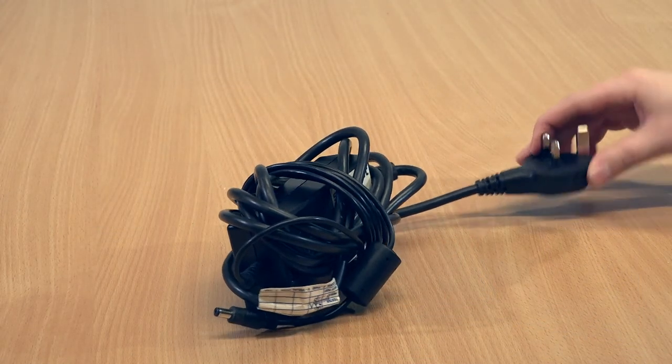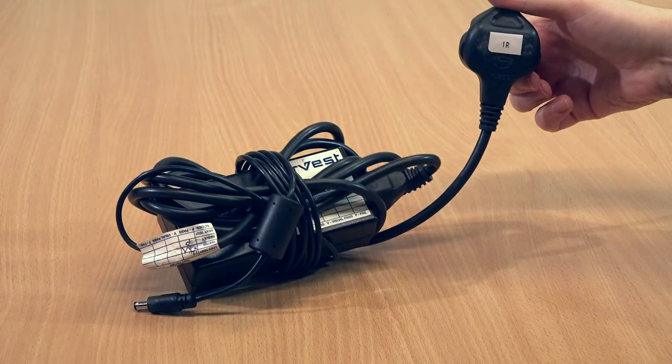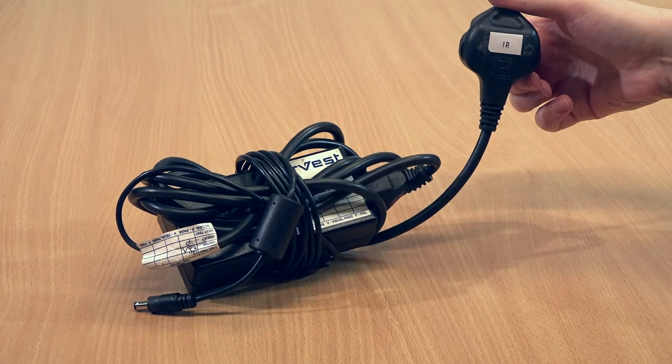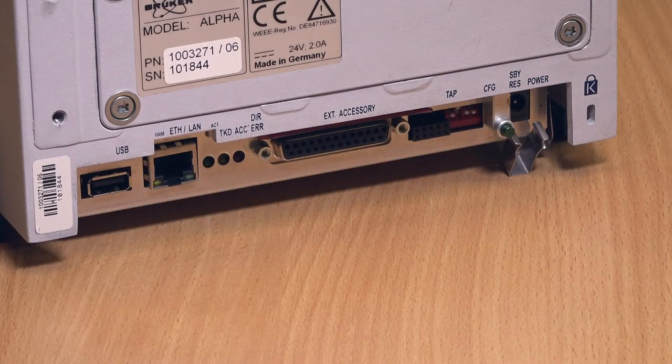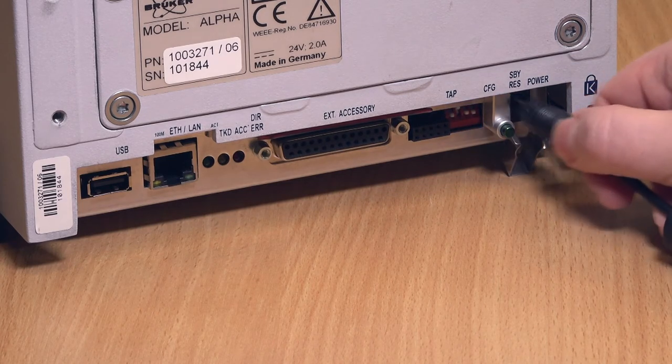The power supplies have the same connecting plugs but different voltages, so it is vital that you use the correct power supply for the unit. Here you can see the labeled supply for the IR spectrometer. Plug the supply into the rear of the spectrometer, making sure to attach it with the clip as shown.